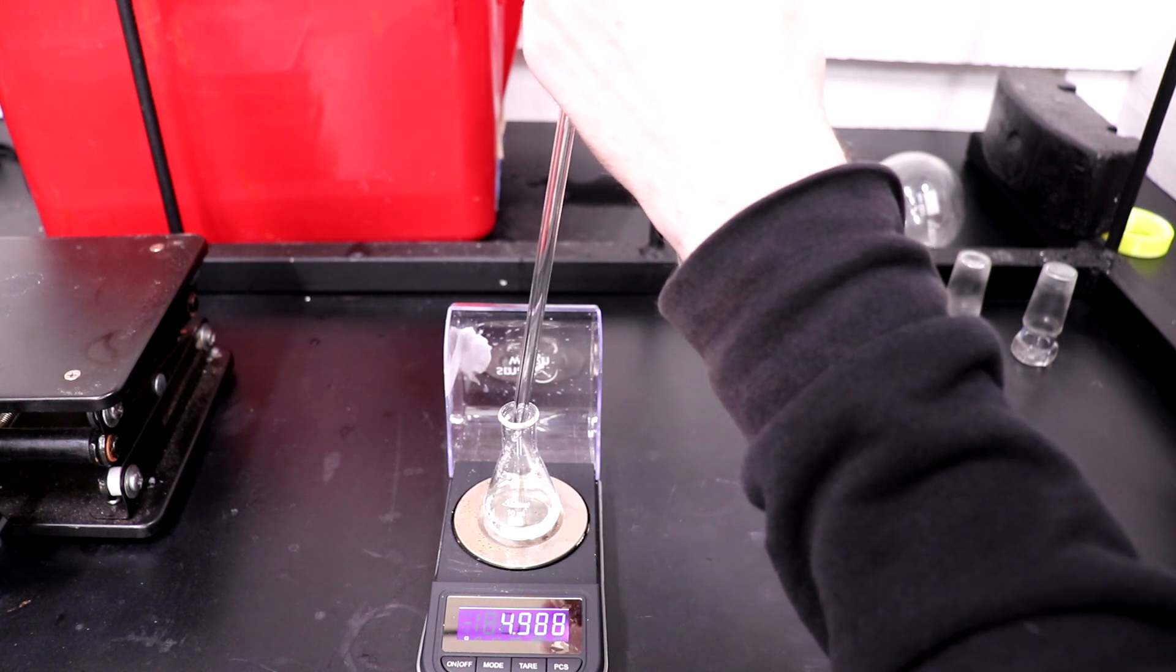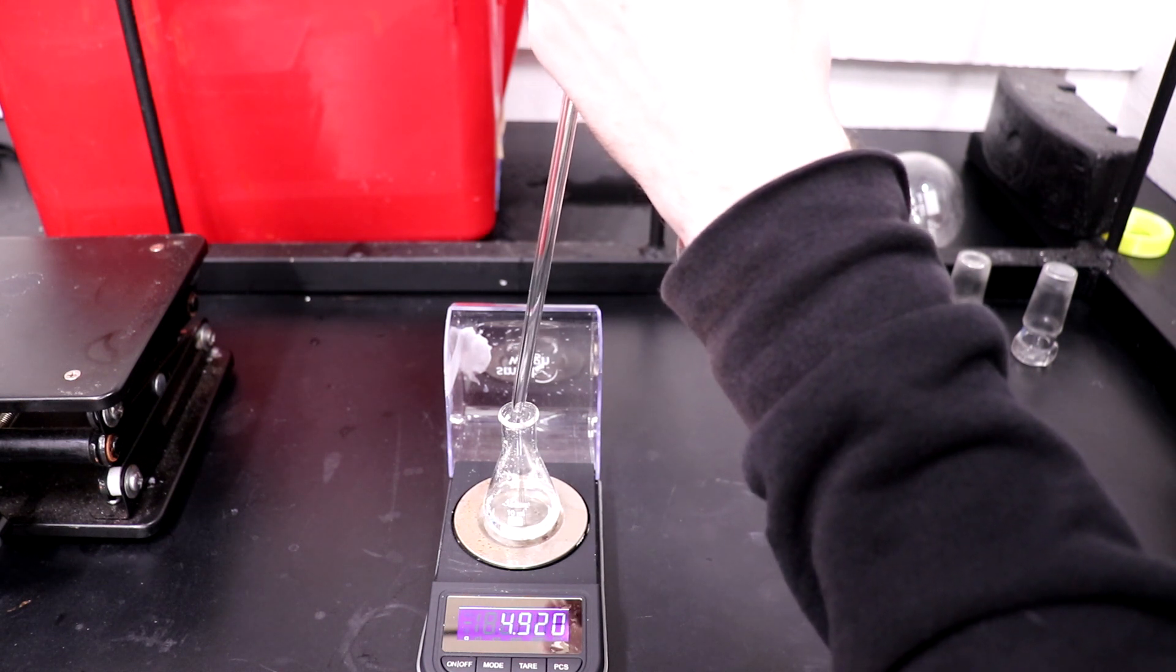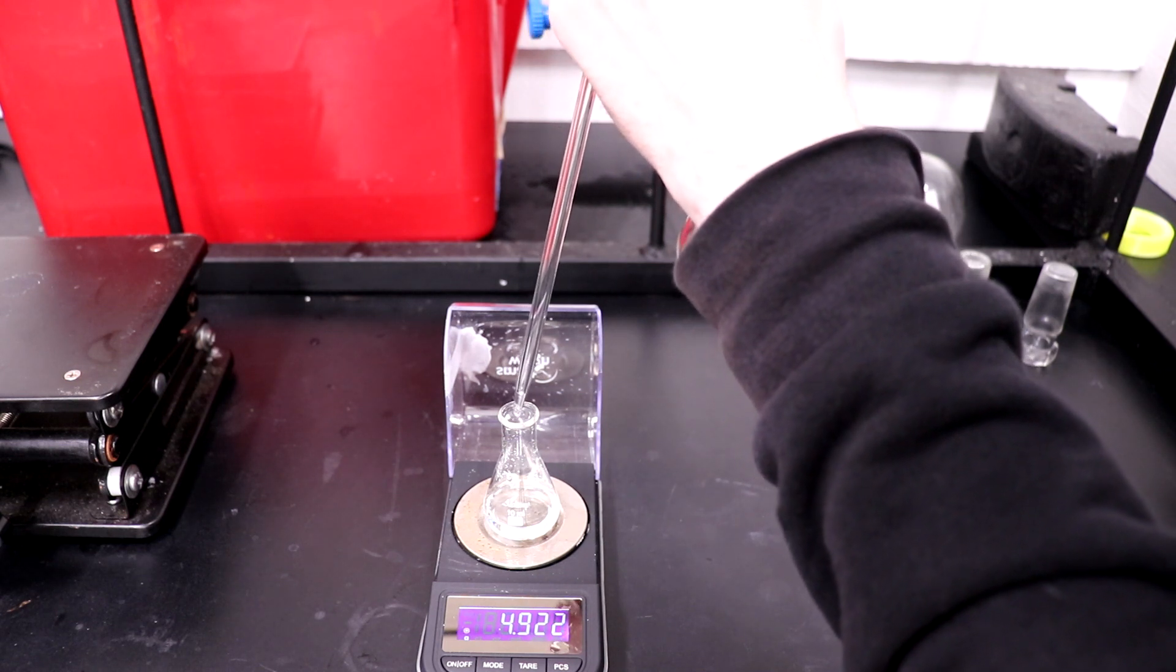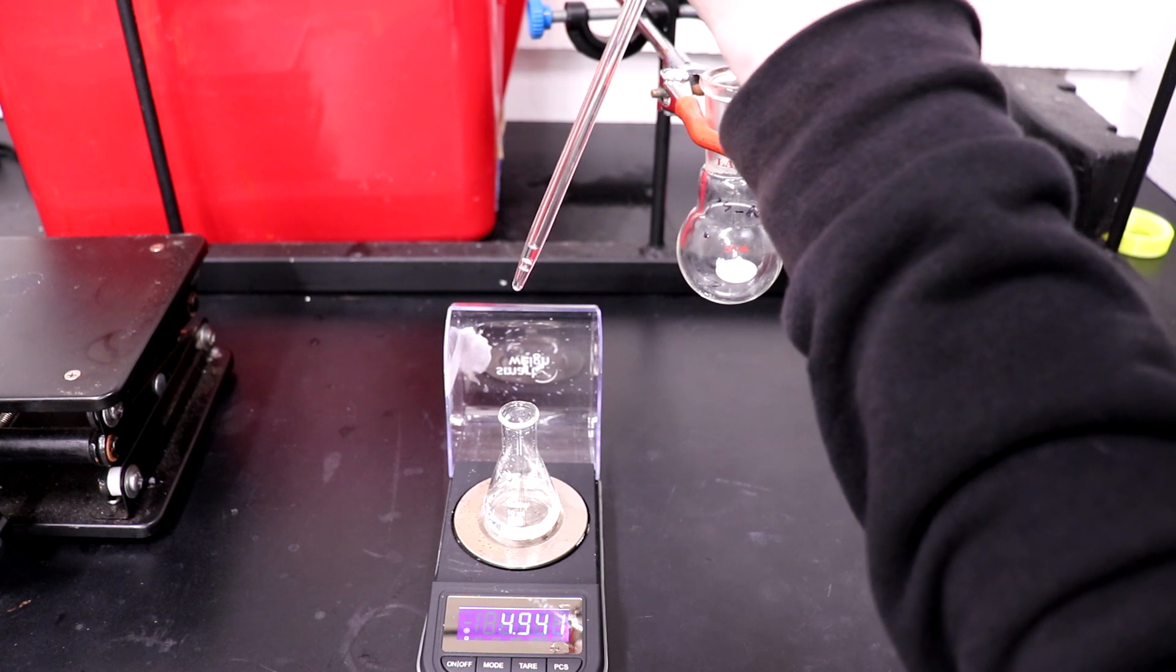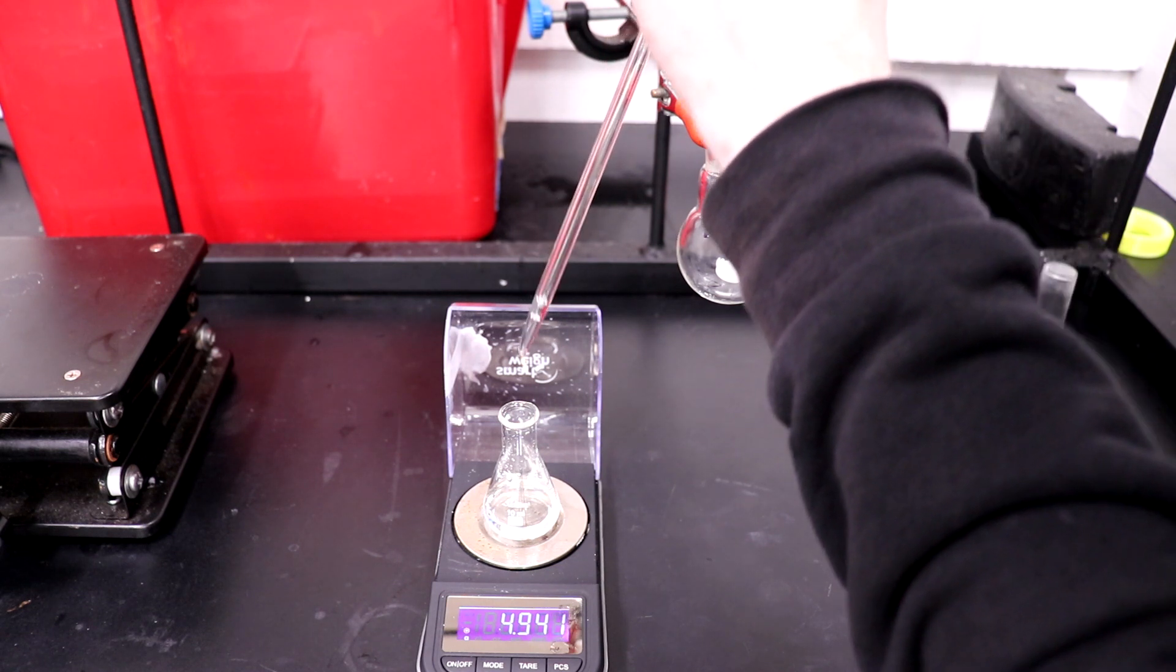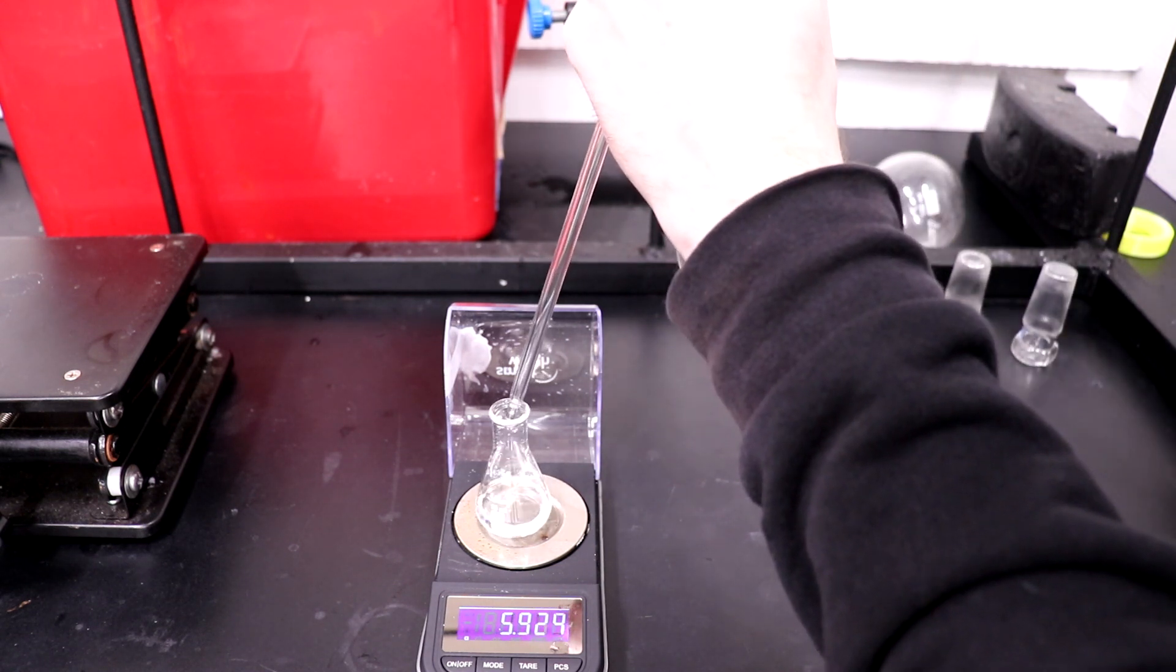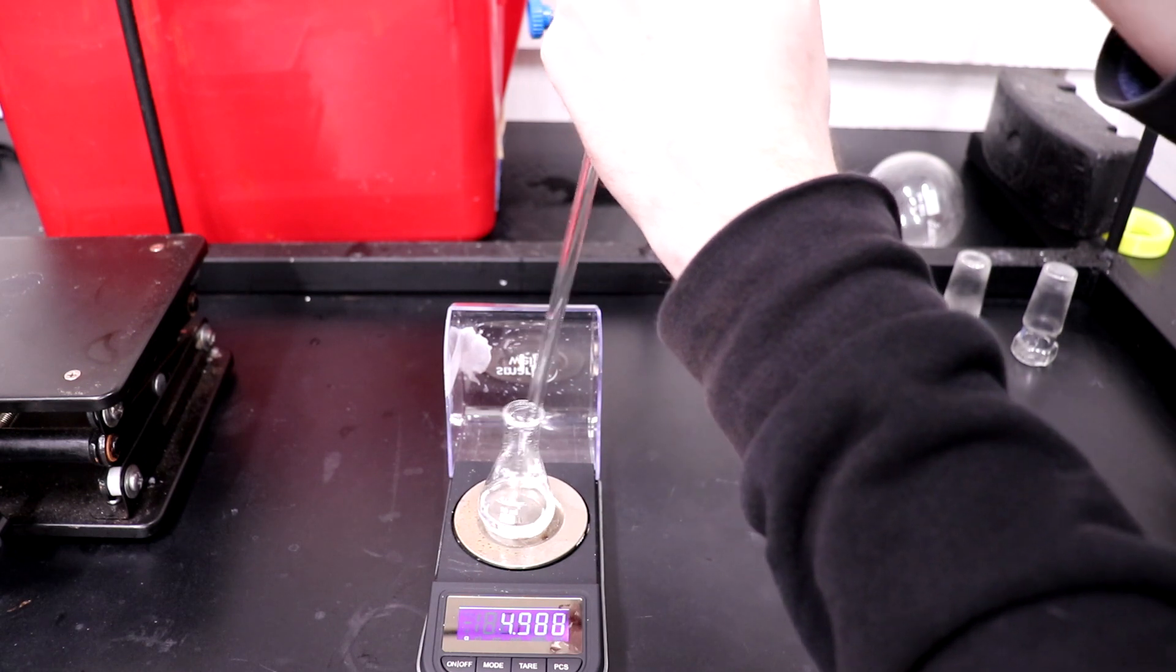I took the density of both of the samples, and they were identical within my measuring error. The average was 1.0029 grams per milliliter, with the theoretical value being 1.004 grams per milliliter, which is again within my measuring error.